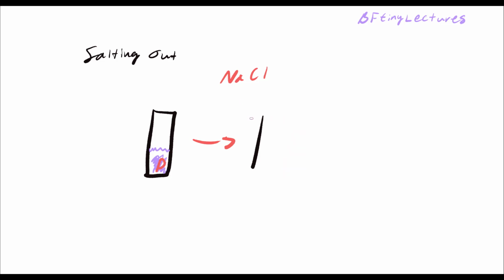It's a really wide test tube. And the idea in this experiment is that whenever you add the sodium chloride to it, the sodium chloride is going to pull some of the water from the liquid. The protein is in a liquid form. The liquid itself has some water content, and the sodium chloride is going to make some interactions with the water because it's polar, and is going to pull the water away from the protein and leave most of the protein intact. So let's say that we have a mixture of something like this, right?